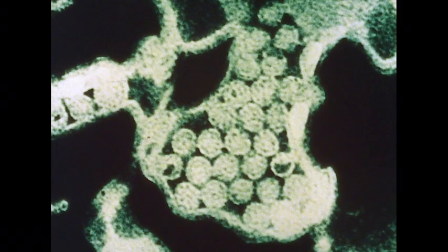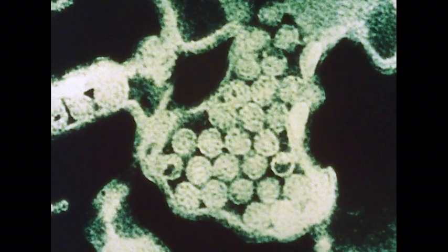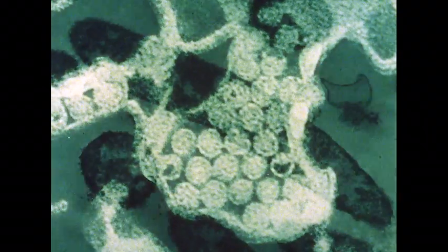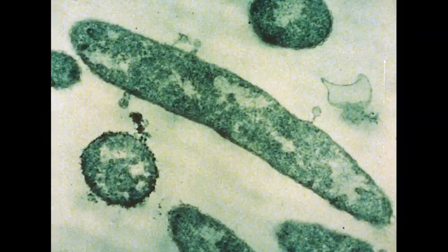The scientist can take polio, for instance, and watch the way the virus replicates inside the cell. Or he can slice bacteria into sections and study different stages of attack as a bacterial virus colonizes the cell.